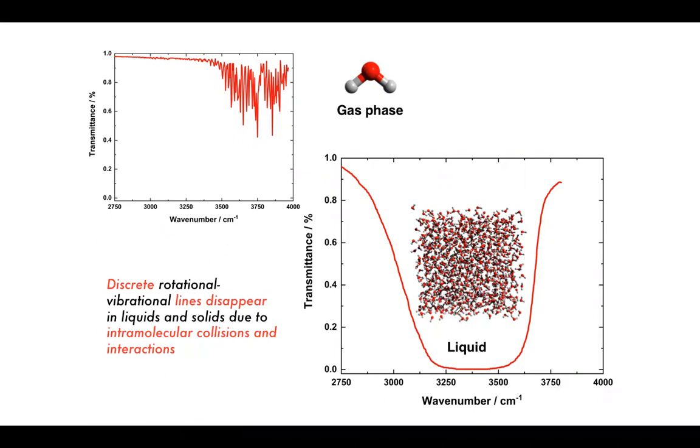These collisions and interactions cause alternative energy pathways to occur and cause changes in the energies of the vibrational levels, and just really confuse the spectrum, because you've got so many molecules all having the same kind of vibrations, releasing their energy in different ways via different rotational lines and different vibrations, rotations, collisions, what have you, that it just causes this incredibly complex spectrum.